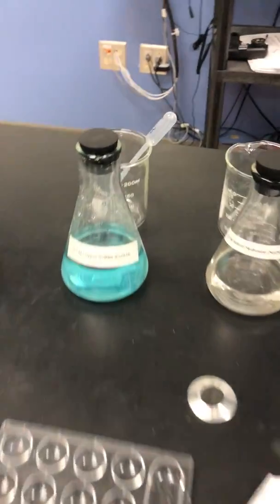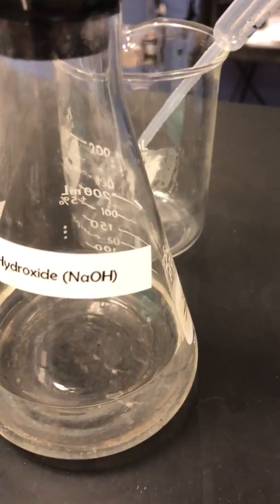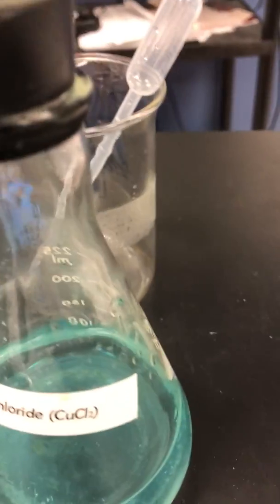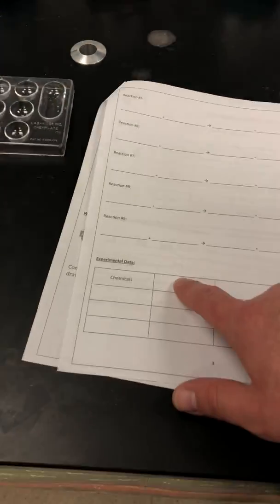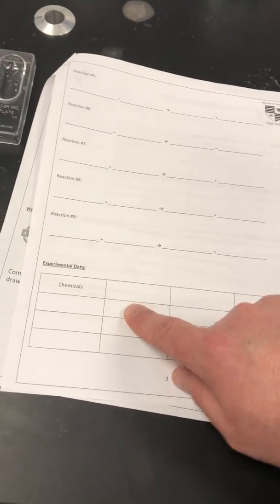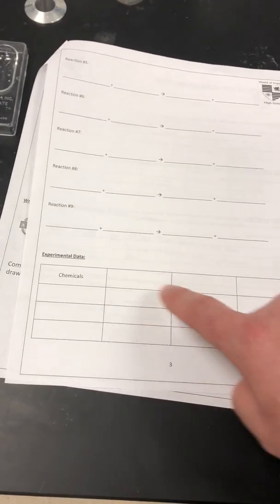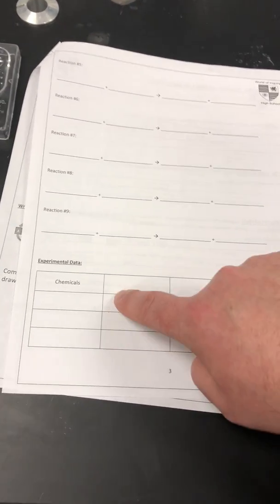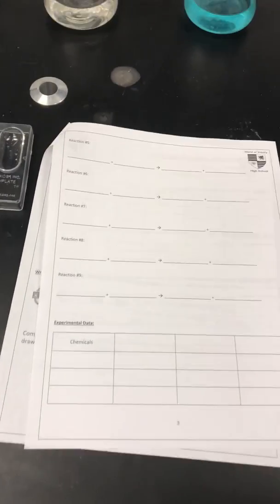All of those different nitrates need to go here. And then up top we've got copper sulfate, sodium hydroxide, and copper chloride. Now you don't need the names, you need the formulas, and those are going to go across the top. These are your 9 data boxes. I would label them 1, 2, 3, or your choice, but you have to label all 9 of them. And this is why.